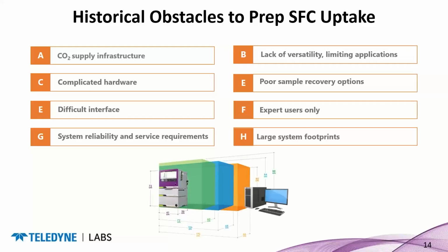So why is it not utilized as much as it could be in today's modern laboratory? Well, even if you go back several decades, a lot of the earlier systems had the challenge of how do I get CO2 to my system? So that caused some people to shy away from using it.